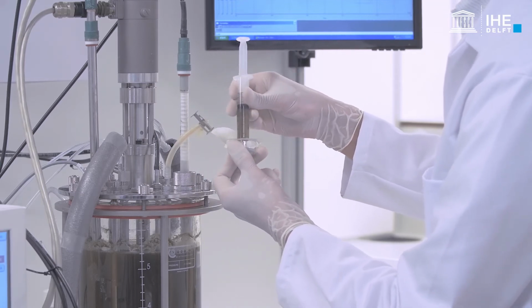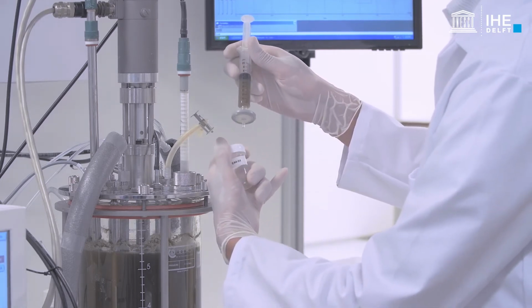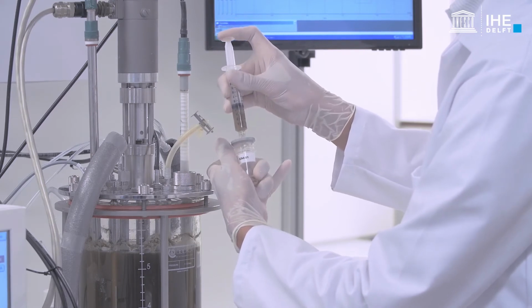Consider the use of at least 2 or 3 filters per sample, because they will likely clog and may break if excessive pressure is applied. This will also contaminate the filtered sample.